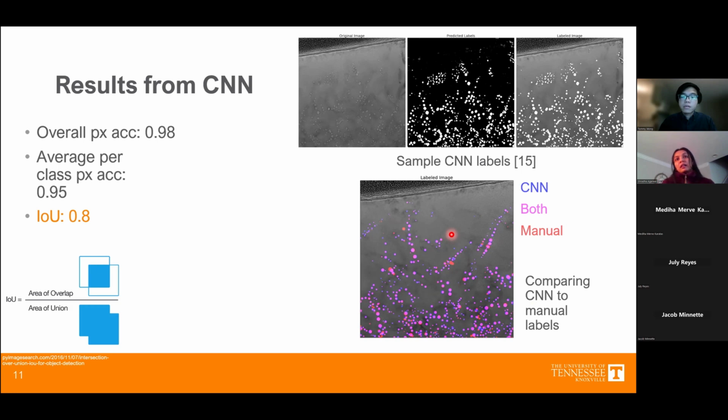Could you comment on the boundary? For helium bubbles and for everything, we need very good boundary information, because the shapes are extremely important for radiation effects use cases. So what can we do to improve the shapes? I see your predictions are small right now.